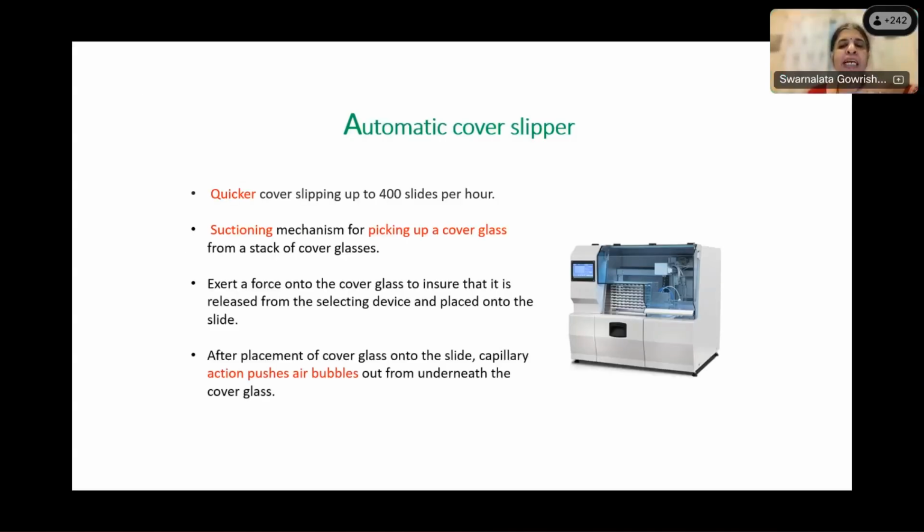And remember, every time that you don't get a good section, either you're compromising on your diagnosis or you're asking the person to stain again, do the test again, which means there's a waste of time, a waste of energy, a waste of your consumables, money. It's not easy. So they must get it right the first time.